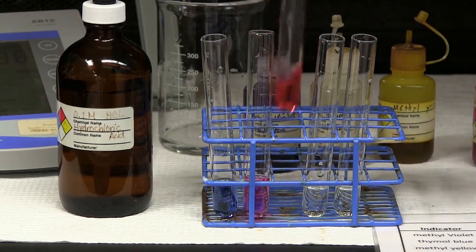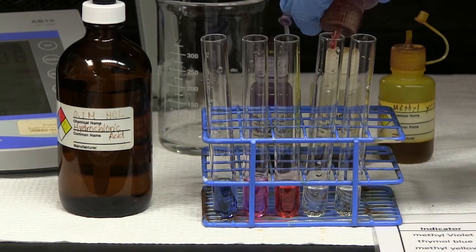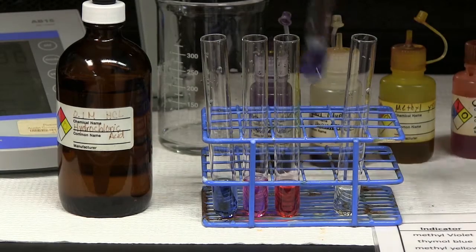In making your estimate, note that the color of an indicator is most indicative of pH in the region where the indicator is changing color.